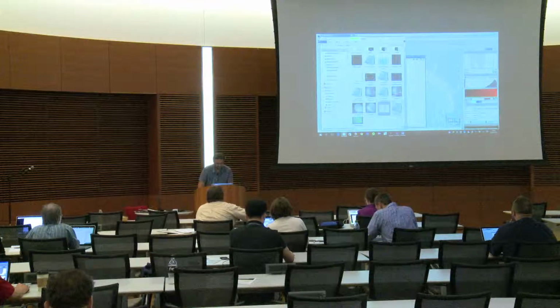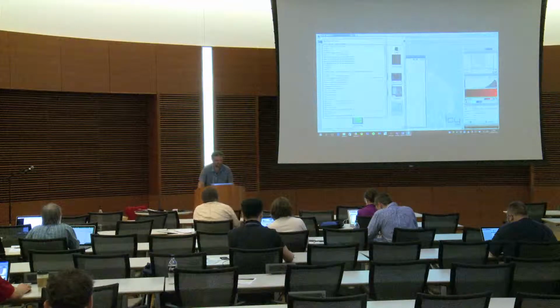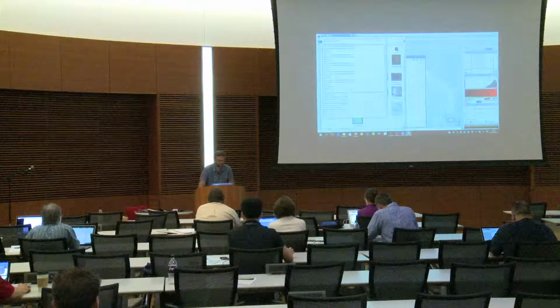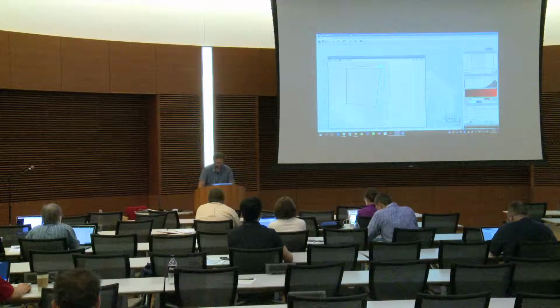I took this one. There is a file here, p7.xml, and in this you have all the extra information that you created, like the pixel size, the channels, the names, and the description of the ROI.